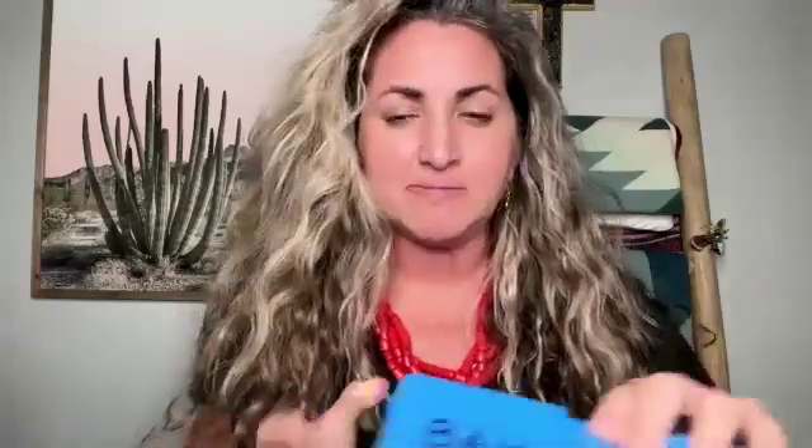This is kind of a delicate time of year to be harvesting, and I just wanted to put out a little video so you knew what a refractometer was. It comes in these little cases — you can find them for 20 bucks on Amazon. It's a kind of fun, science-y thing to do to drop a little bit of honey on there. That is how you calibrate it and that is what you're looking for. It is super easy. I hope this helps somebody make sure they have their water content right in their honey.